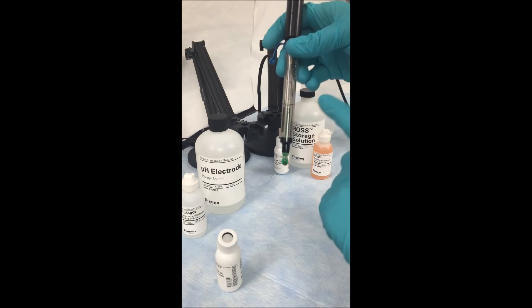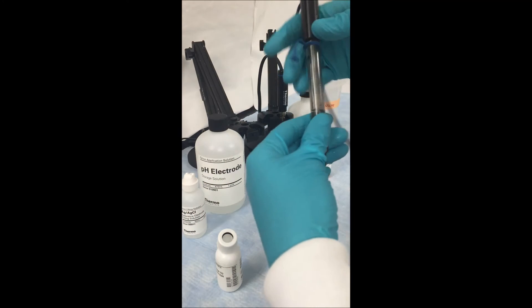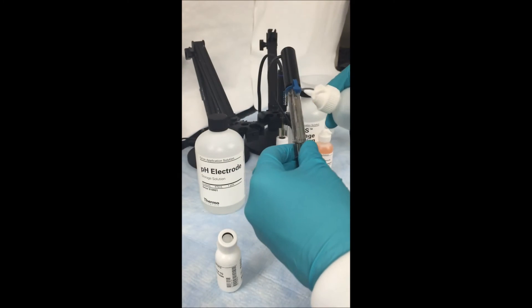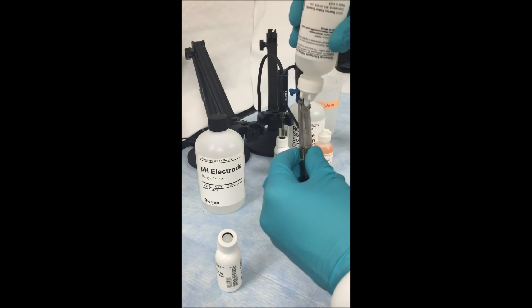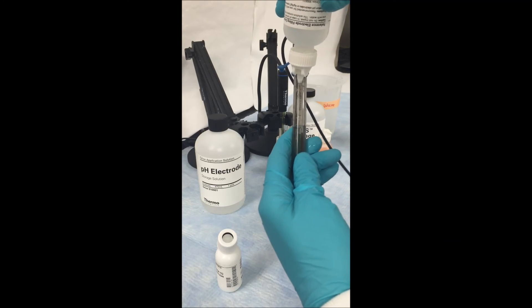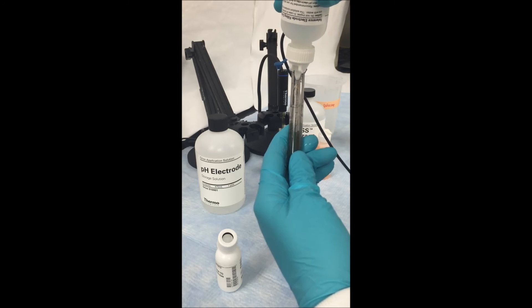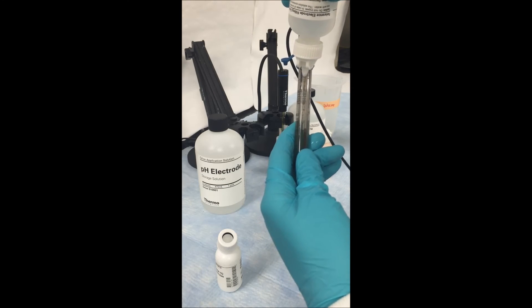Once the electrode is removed, you want to make sure that you fill it up all the way before using it. Locate the fill hole on the side and, using the appropriate fill solution, fill the electrode all the way to the fill hole. You always want to make sure that your internal fill solution is at least one inch above your sample at which you are measuring.